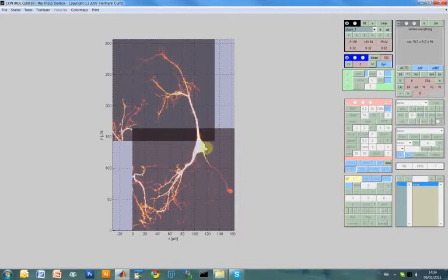I'm starting again at the point where we left off after video tutorial 1. So the two image stacks here have been loaded already, and we've set the voxel size, etc., and alignment in the stack panel. So we immediately go on to the thresholding panel, which is this blue panel here.